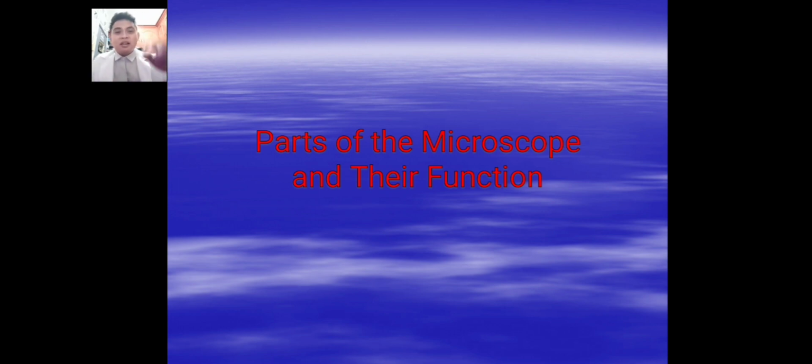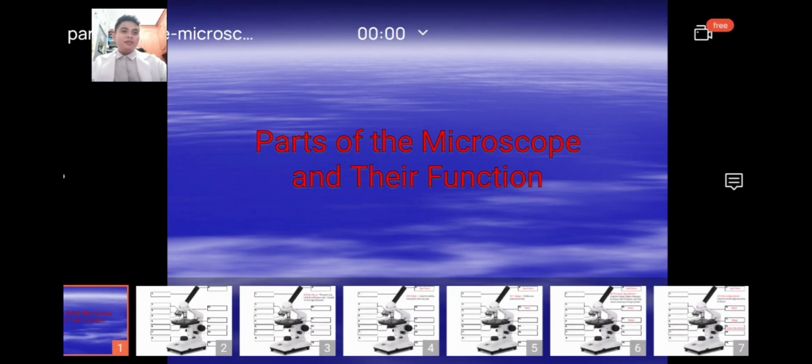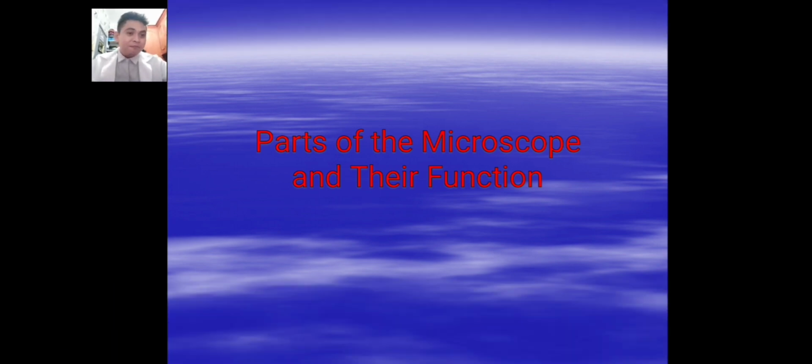Why? Like Robert Hooke. Robert Hooke discovered cells by studying the honeycomb structure of a cork under a microscope. Wow, 'di ba? Napakaganda ng creation ni Lord, and one of these is the microscope, 'di ba? Nabigay sa atin ni Lord. But let us move on to our topic.